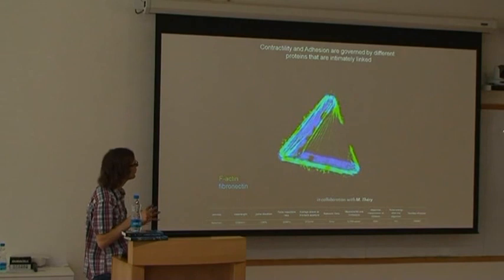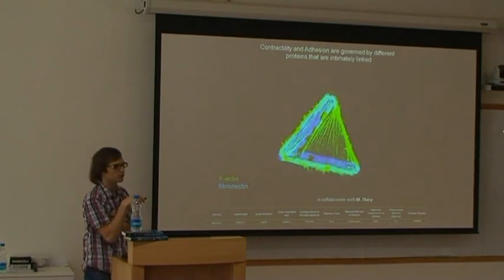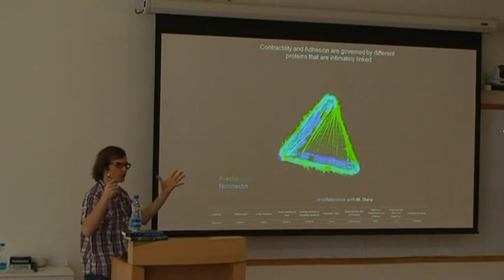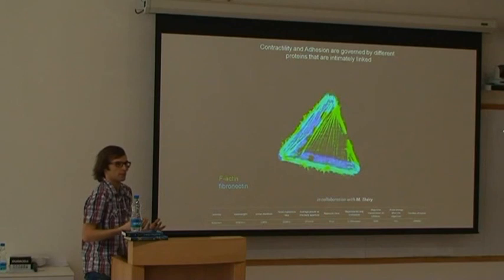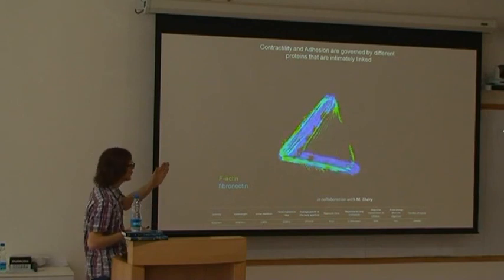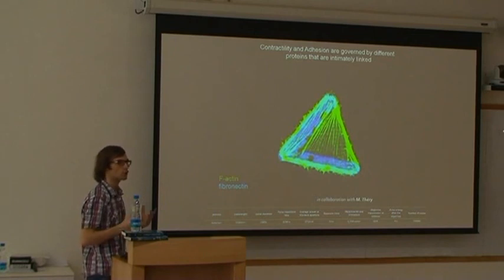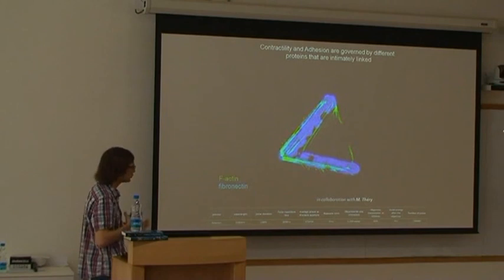So we did other tests. In this case, we did not spend time doing any control on the membrane. But it's true that when we did break the membrane, we saw many leakages, and there was much flux of the cytoplasm. So normally, by doing this experiment like this, we were quite sure that there was no major membrane disruption. Maybe a little membrane damage that was then healed, in the worst case, but not major disruption, because the cell would just empty out.